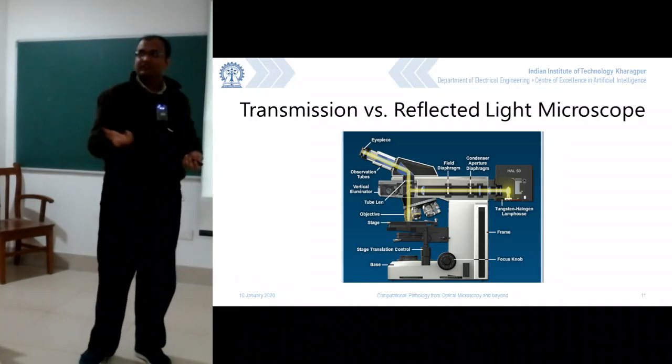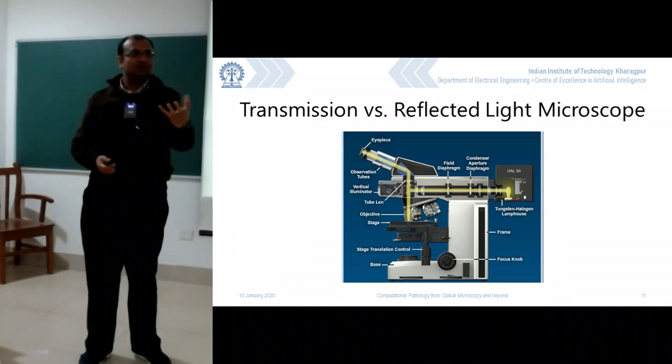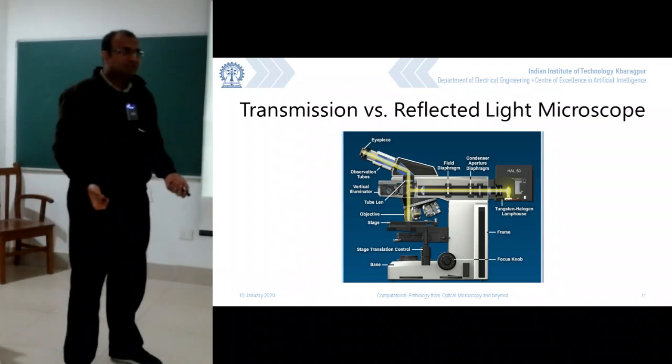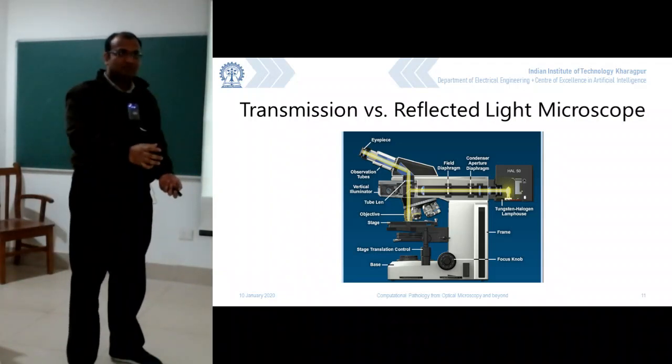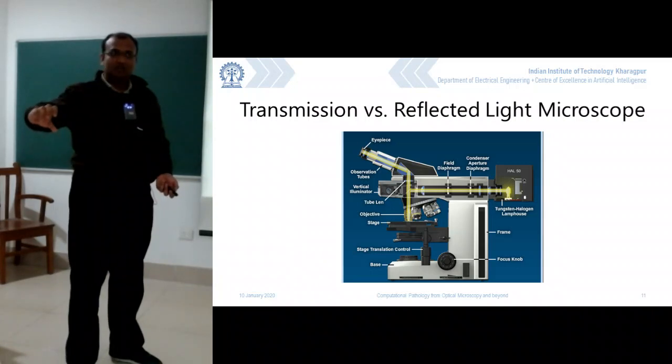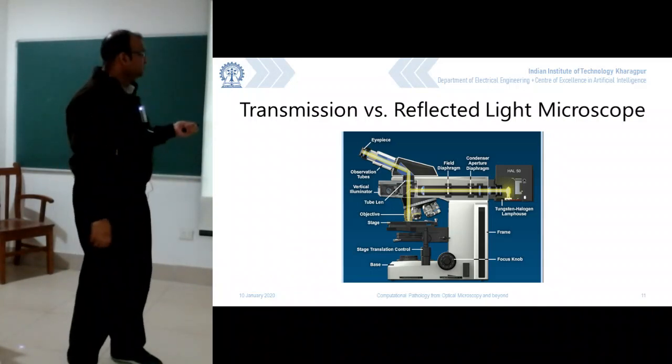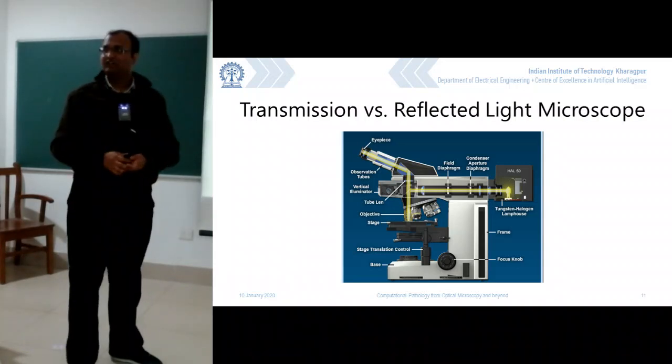I mean, this is the same example as when you have a bulb and you shine a torch at it. Shining a torchlight at a bulb is not going to fuse the bulb in any way, nothing goes wrong over there, and effectively it does not change the intensity. But if you are looking through a smaller lens with a smaller light source and you shine a torchlight on your eyes, then you will be blinded. So that's the whole issue which you will have to take care of through this clever optical design.